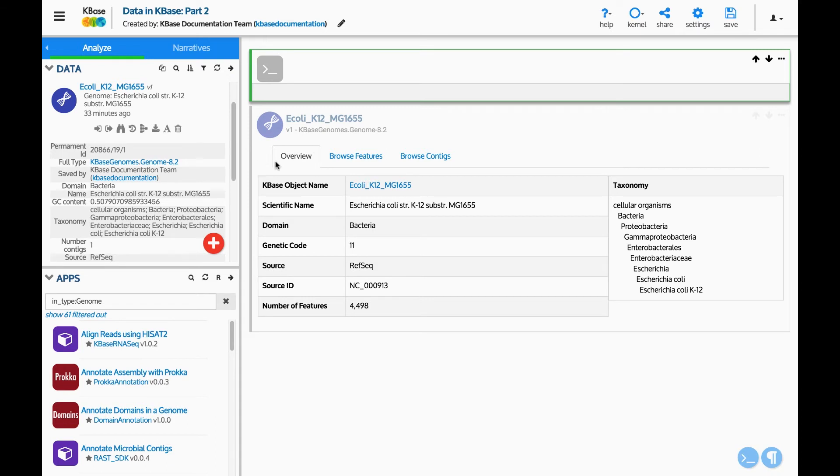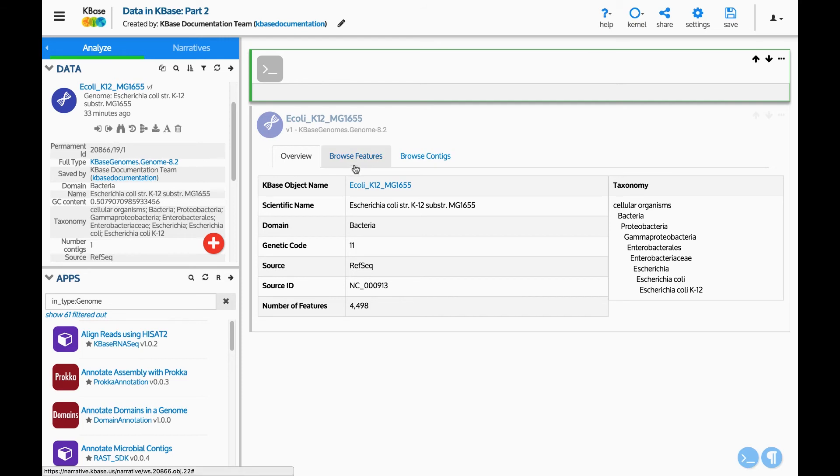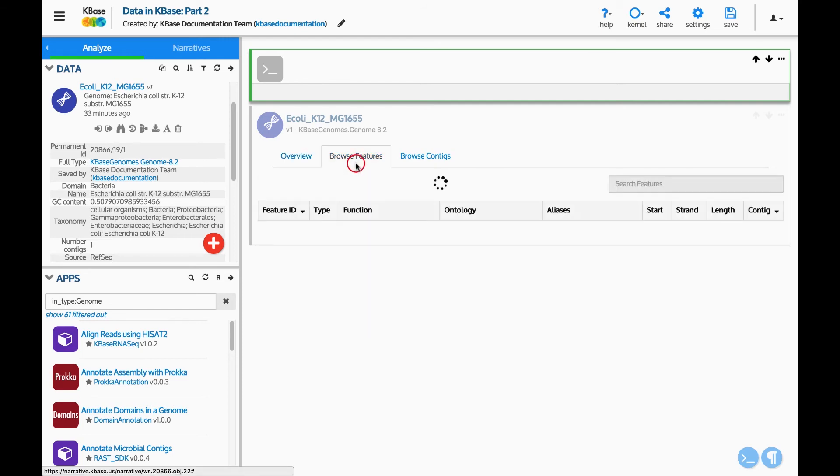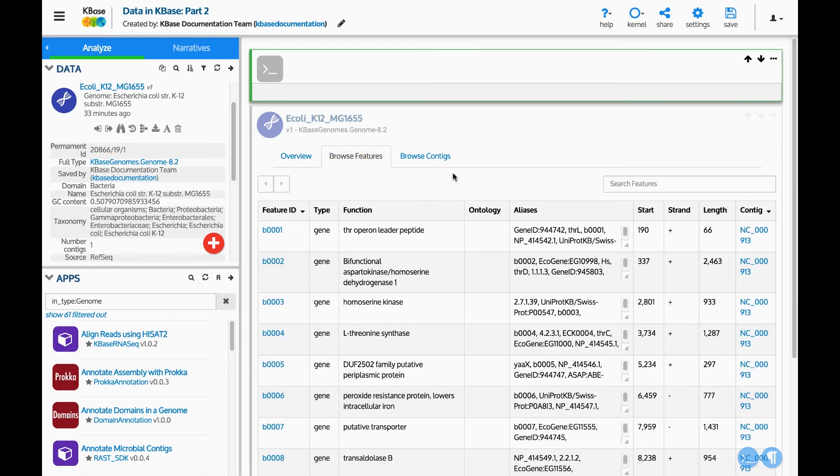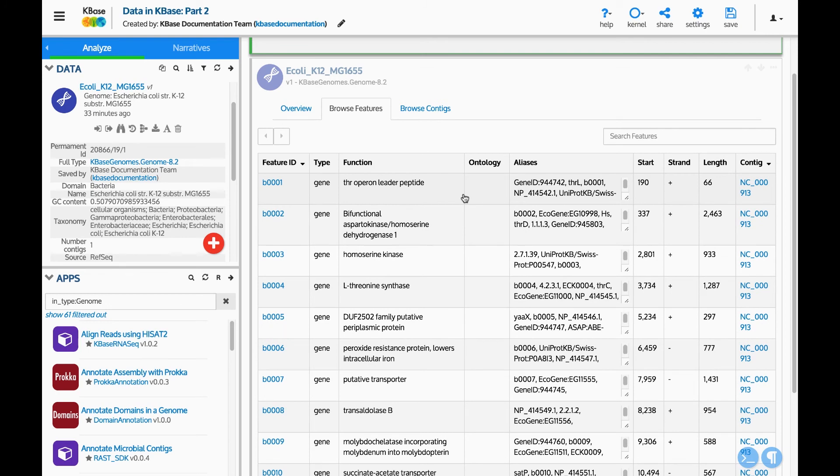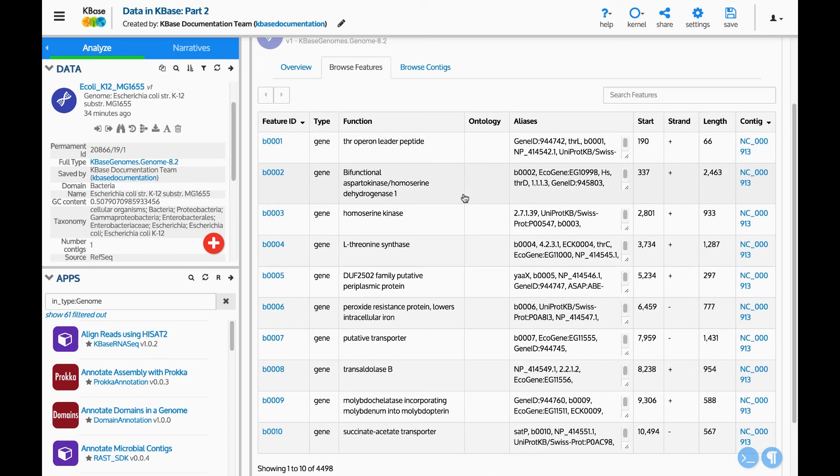In this case, the viewer provides information about the genome, including its sequence and annotations. Click the tabs at the top of the viewer for more details about the contigs and genes for this genome.